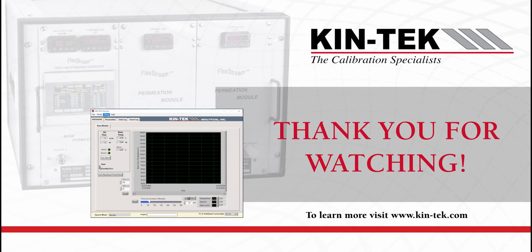The next series of videos that I'll show, I'll vary these different modules and show you how to interact with a secondary dilution and even a humidified gas module. So please visit me on a different video and we'll go over more items related to the FlexLink software. Thank you.